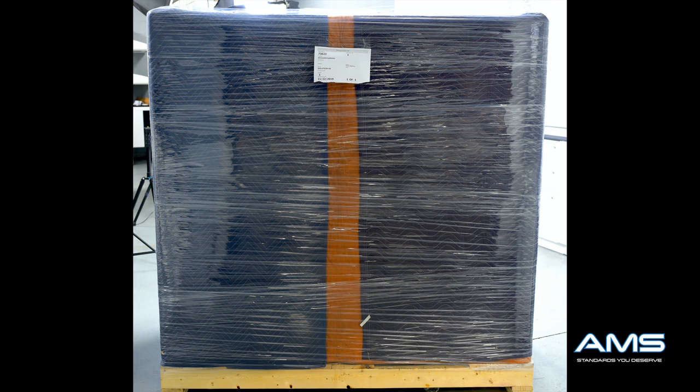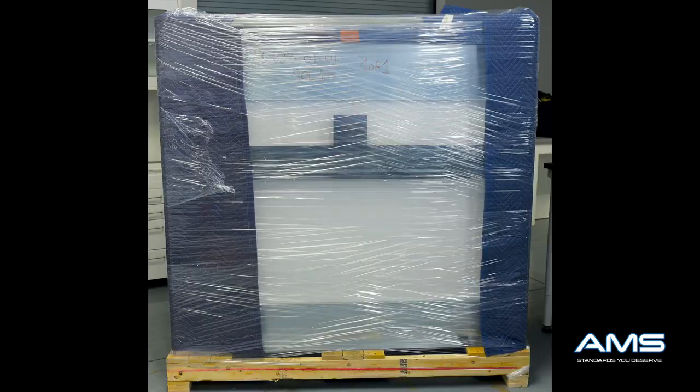You have now received your fume hood. Remove it from the truck and inspect it for any damage. Next, move the fume hood to the storage area or room where it is going to be placed.